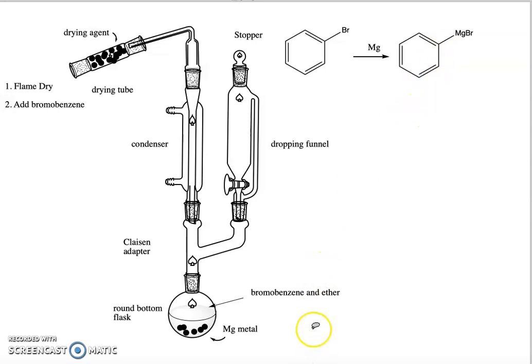If everything's dry, it will start reacting to make our Grignard reagent and this will give off heat. It'll give off enough heat so that the ether will actually start to boil on its own and you'll start to see drops of ether forming on the reflux condenser and dripping back down into our flask.